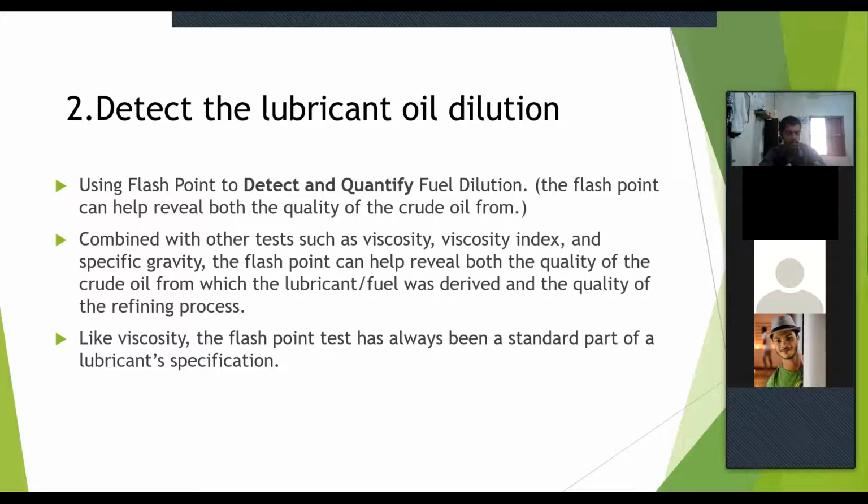If we have some lubricant oil, by using temperature, this kind of test, we can find out about that crude oil. From crude oil we get different fuels and oils, and grease and everything. That is the base, so we can find out the quality of the base also. If you have good quality in the base, we will get good quality in all the products. If we have poor quality crude oil, then whichever petroleum corporation we use, it doesn't matter, we'll get low quality fuels.